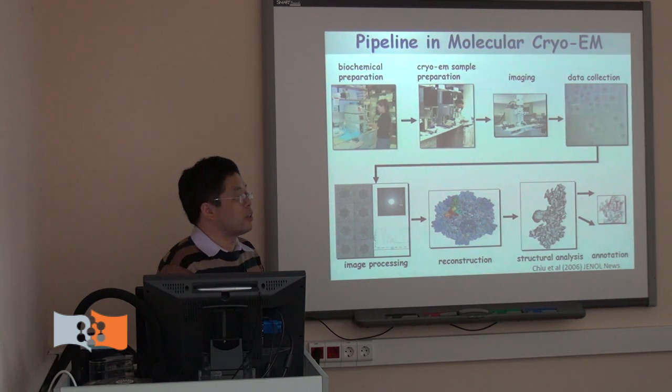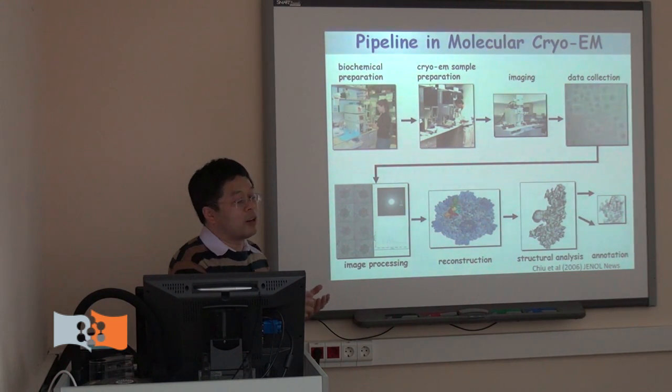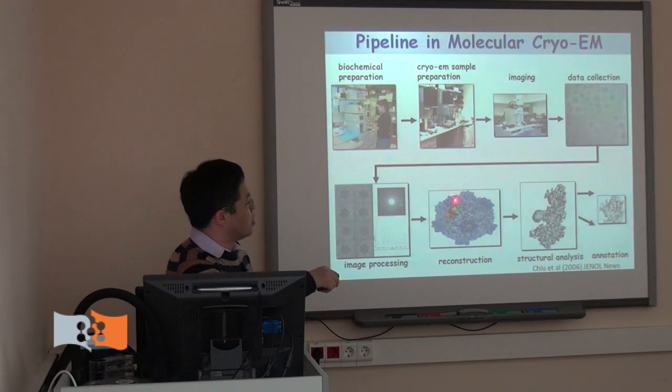If you get into 3 or 4 angstrom resolution, then you can develop the whole atomic model of the virus without knowing the X-ray structure. So you can build it de novo. This depends on the resolution you achieve, so you can build a real atomic model or a pseudo atomic model.